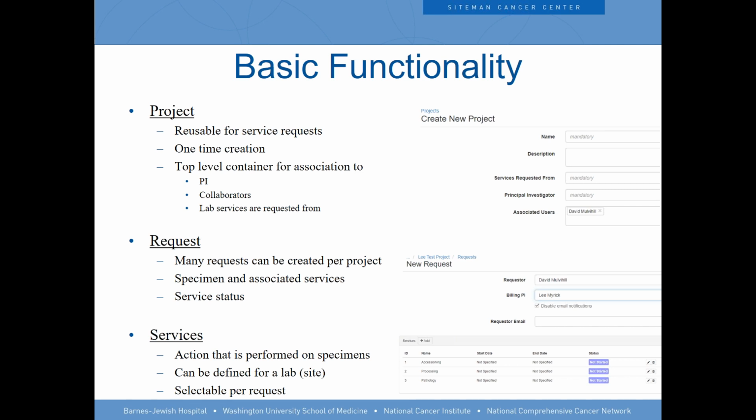Sure, sure. So the next question is something that we had spent a lot of time on when we were developing this. It's coming from Donna from University of Utah. Is it necessary that all the specimens are already in the system? Can you just create new specimens or request new specimens that are not in OpenSpecimen yet?